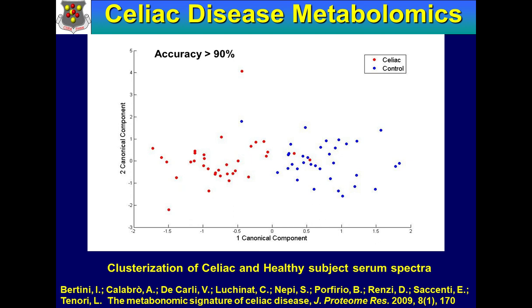This is just a few flash examples of what we have done, and this is all CERMMP. I'll concentrate on CERMMP today, where we have looked at diseased and control people. This is a standard statistical approach like multivariate analysis, this is PLS, for instance. And you see that people with celiac disease are clearly discriminated from people who are controls, who are healthy.